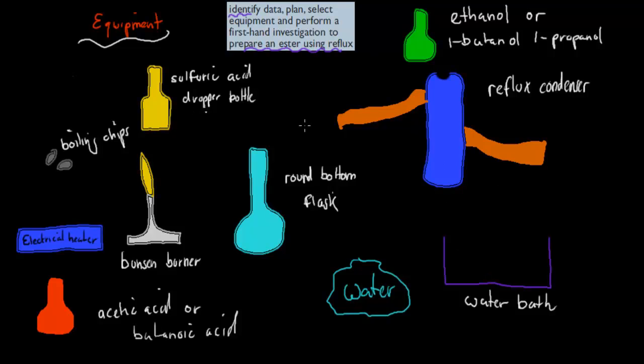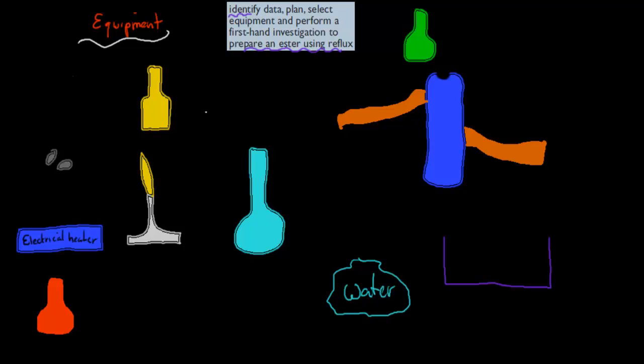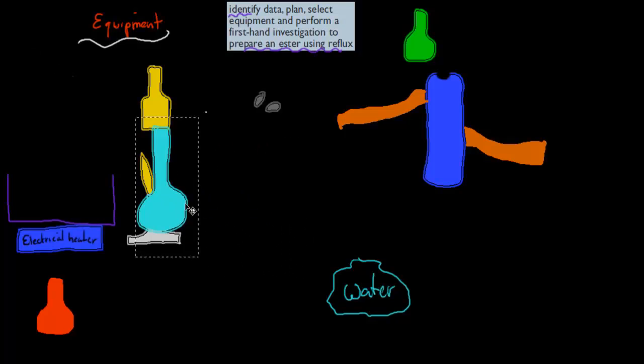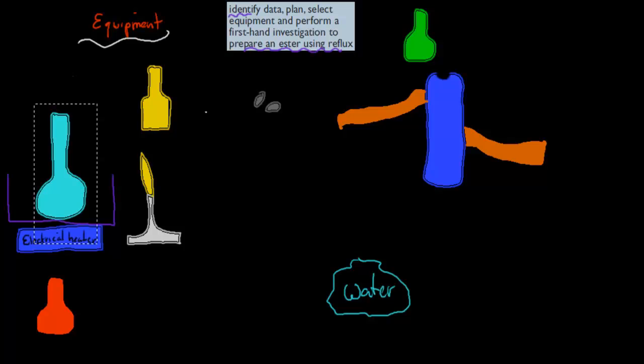So that's your equipment you would have had, and now I'm going to set up the actual experiment, or what you might have done, something similar to what you might have done in class. So you had these are the things you had. We used the electrical heater. So you might have also grabbed the water bath. Then you would have filled that up, you would have put your round bottom flask in it. You would have put some water on it as well, just to absorb some of that heat.